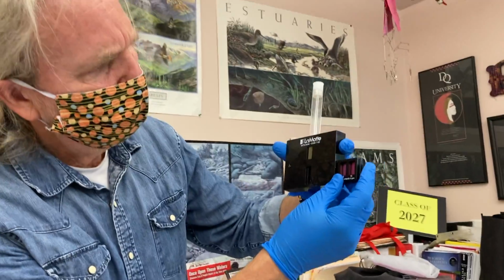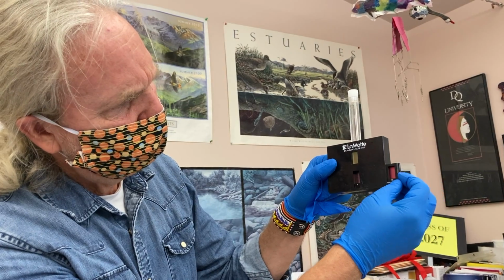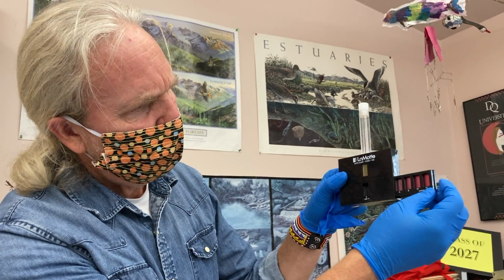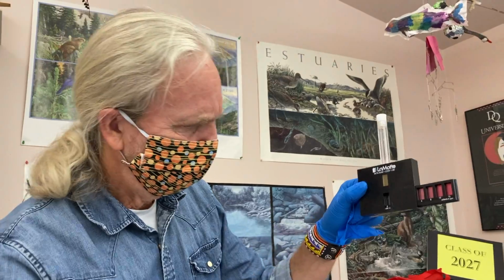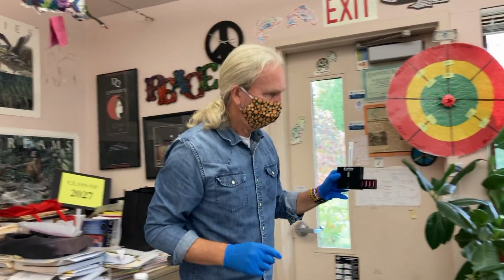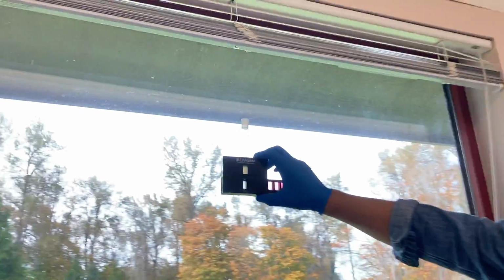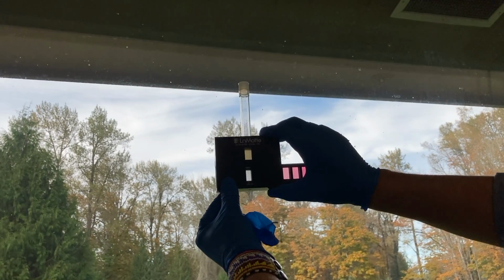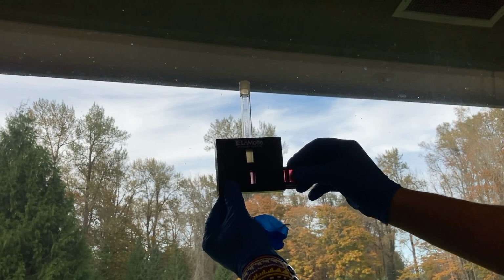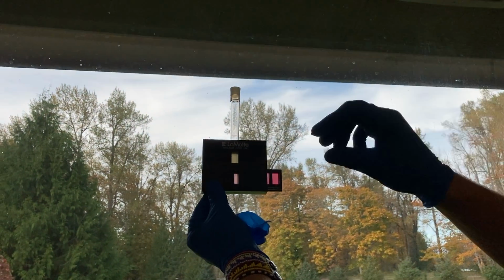We're going to go over to the window so we get some light behind it. So we're going to try and match up the color, and that will tell us what our nitrate level is. So let's go over here. And hold it up to the light. And we can see, let's see, if it was higher nitrate, it would be more pinkish.